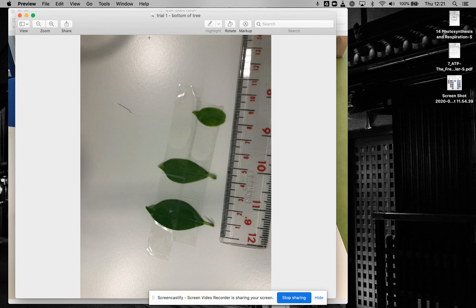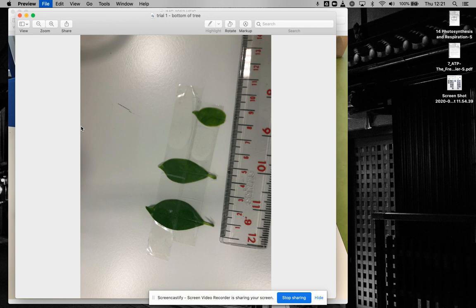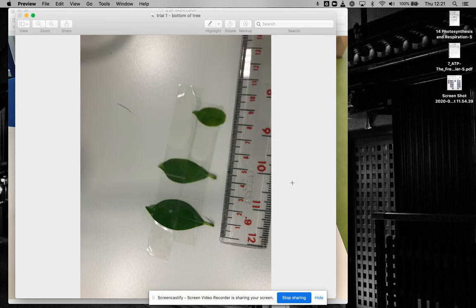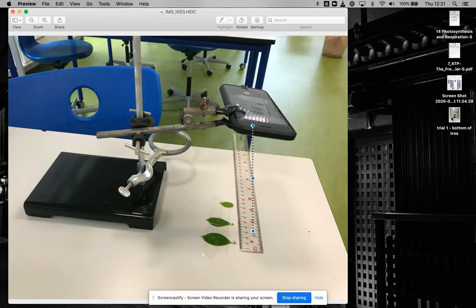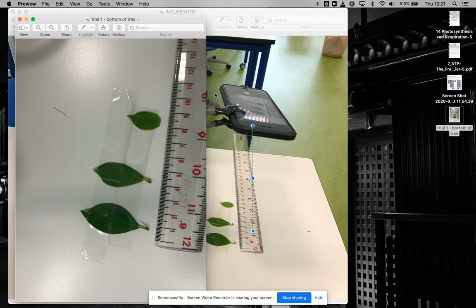What you need to do is export that file as a JPEG. You would export it as a JPEG, do the best quality, hit save, and it pops up right here. That's the one you want to use.